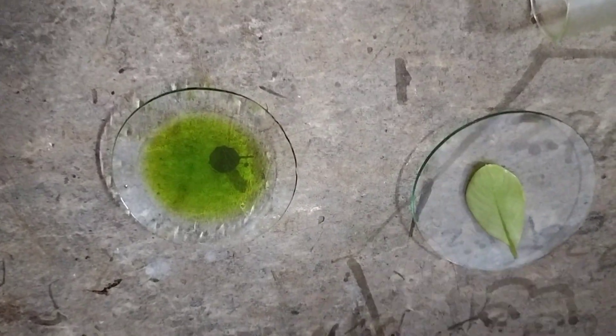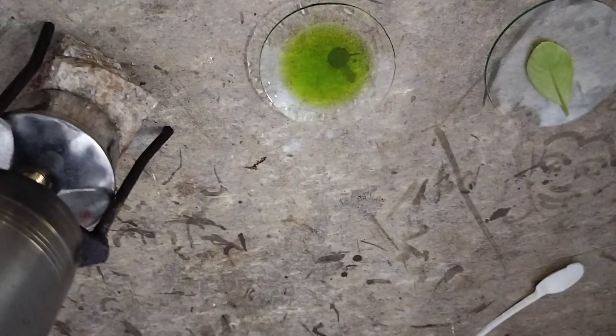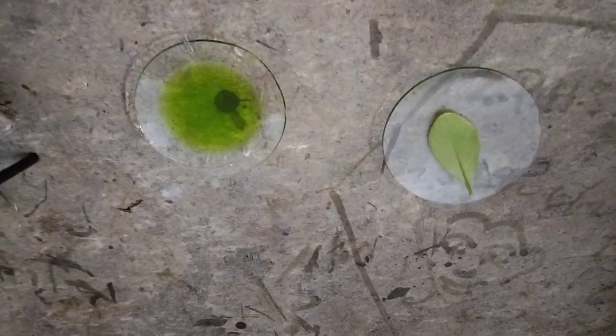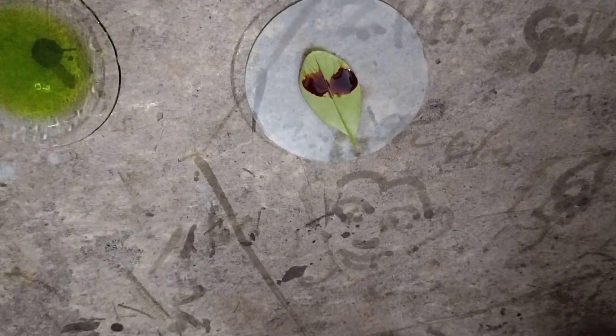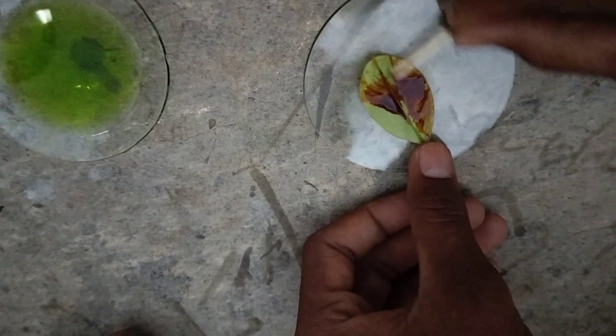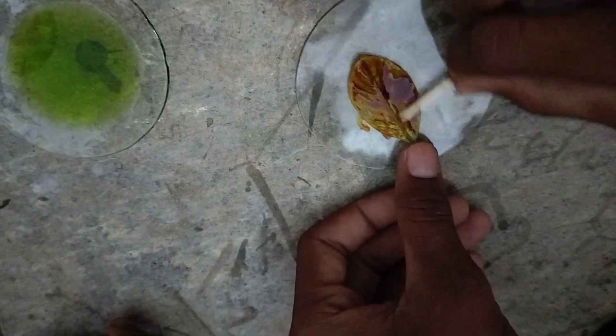Take out the leaf and keep it in the watch glass. Let's test it with iodine solution. The colour of the iodine solution is brown or yellowish orange. I am keeping two drops of iodine solution over the leaf and spreading the iodine solution through the leaf properly.